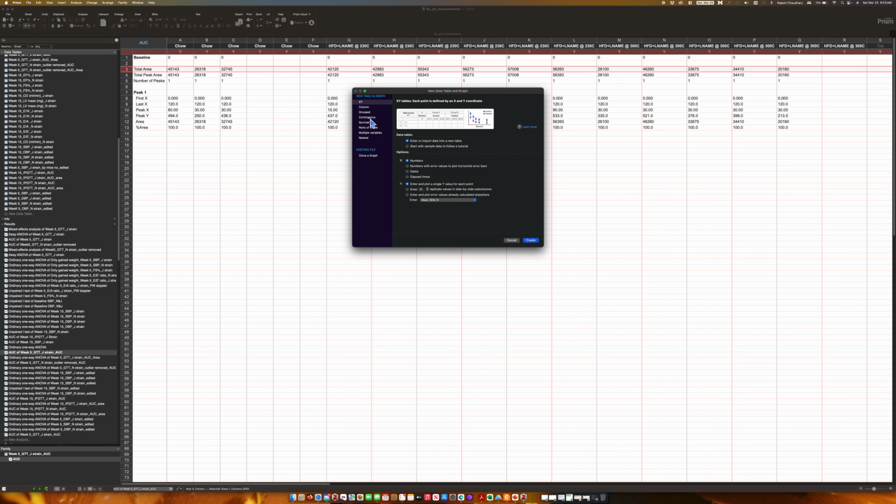But this time we are going to choose as a group. Once we choose as a group, we choose the option like an inter individual replicate value. So basically, when you choose that option, what it means is that whatever number of animals are there in your one group, you choose the maximum value.